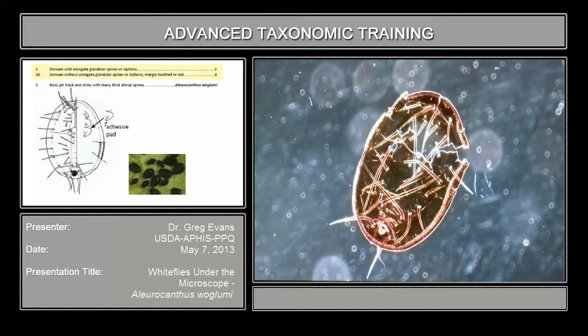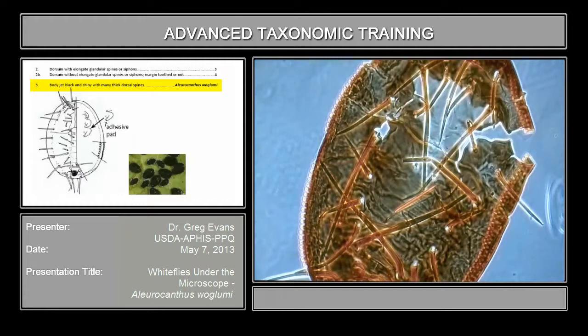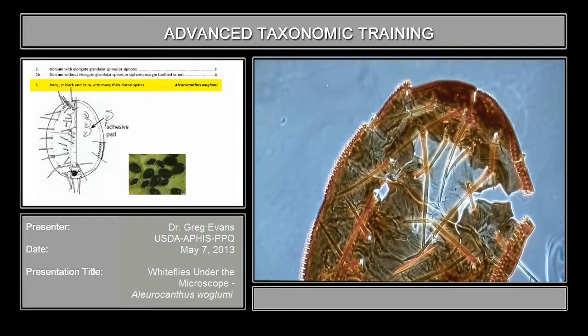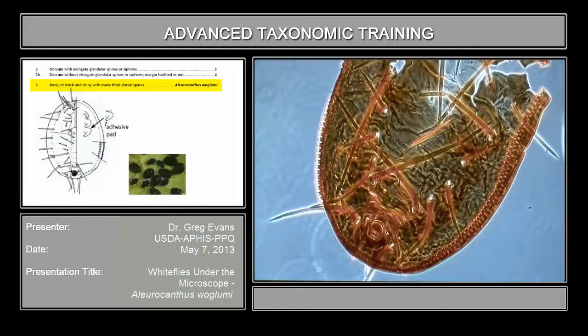This one has those very large spines. You can see that they're all over the body. They're long and thick, and the body margin has very long teeth along the margin. Because it has those very long spines, and that character is pretty much unique to Aleurocanthus, that alone is enough to identify to genus.